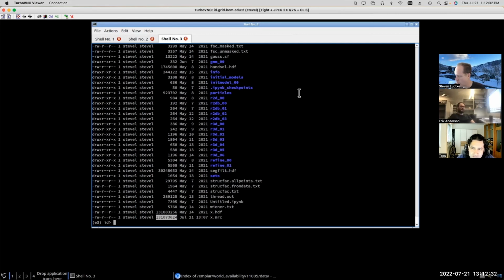So if you're storing a bunch of class averages, the class averages would generally be stored in an HDF file themselves. And once you have a class average, the membership of that class average wouldn't be changing. So that would be a parameter I would normally store directly in the header in the HDF file. You don't need to use this LST mechanism for that.